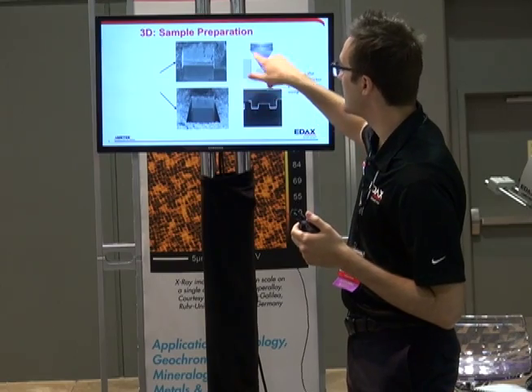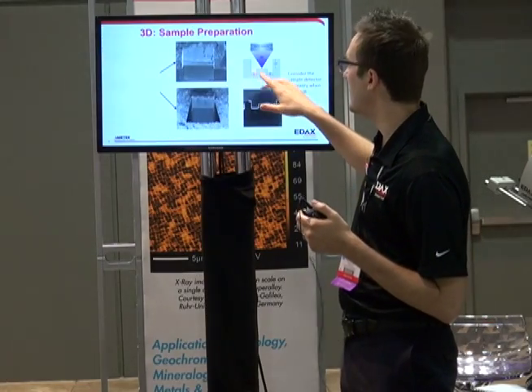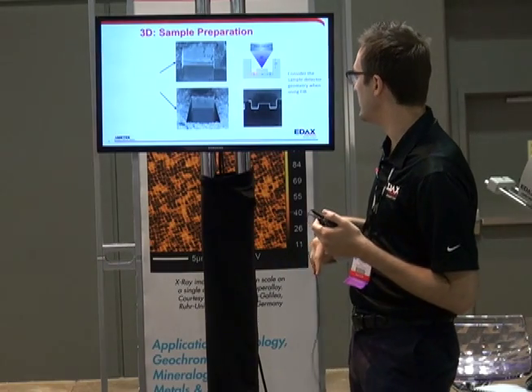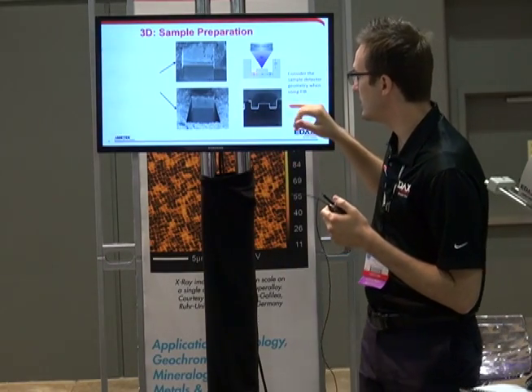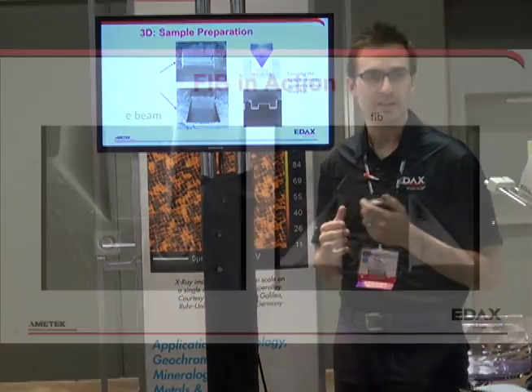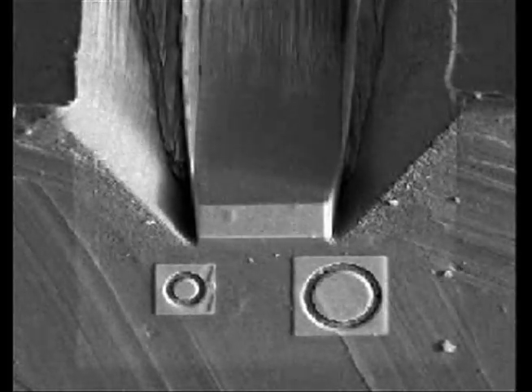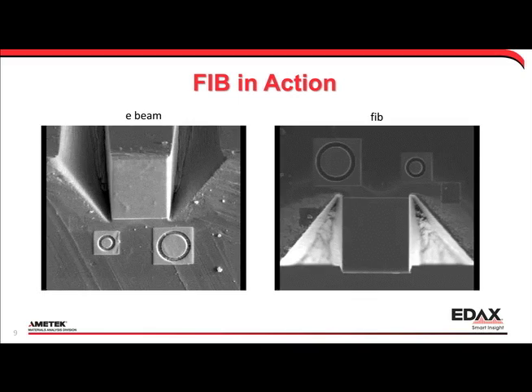The idea breaks down into two views: the electron column and the FIB view. When you scan, you want to make sure there are gaps or trenches on the sides of the area you'll be looking at, so that material can deposit into those areas and you have enough solid angle to get information out without capturing the edges. Here I'll show a quick video of what this looks like when milling — it's being milled and it's working — shown from both the E-beam and FIB angles.